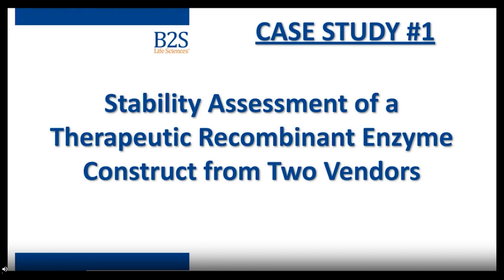So today we're presenting 2 case studies where the UNCLE instrument has aided our characterization through advanced characterization methods, what those outcomes were, and key learning points from each case study. The first case study examines the advanced characterization of one enzyme, which was produced and provided to us by 2 vendors. We had reason to believe that the 2 isozymes differed in biochemical behavior and warranted a closer look.